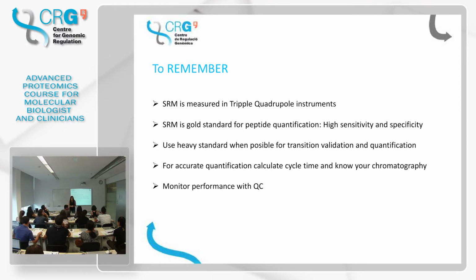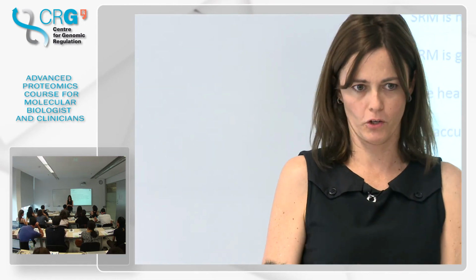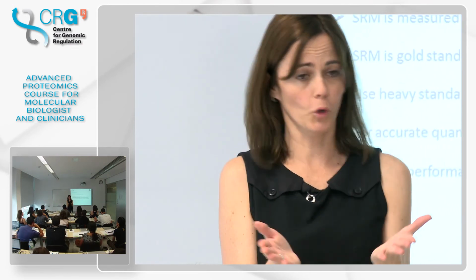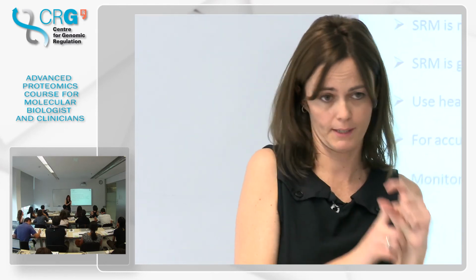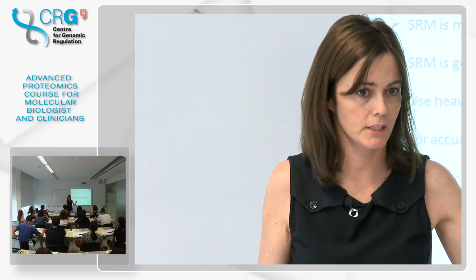If I wanted to measure 90 proteins, it's possible, but needs more time. In the more practical talk after the coffee, we will see this. But you have 2 options. Do more runs of the same sample: if instead of running your sample 1 time, you run it 3 times and you measure more things.